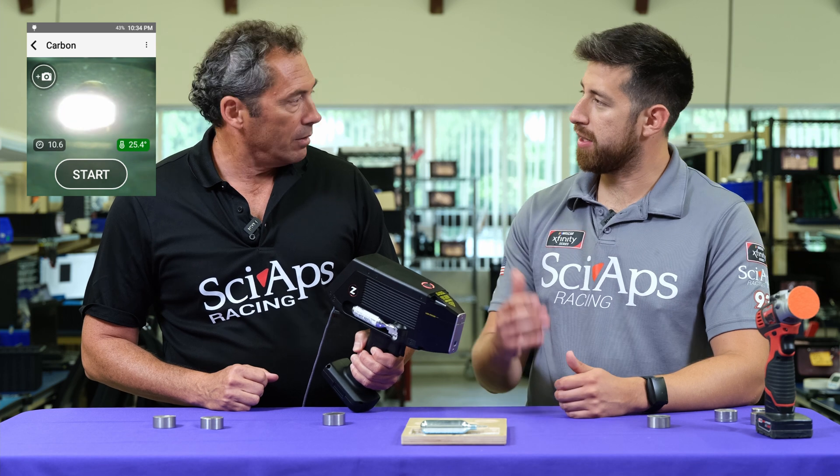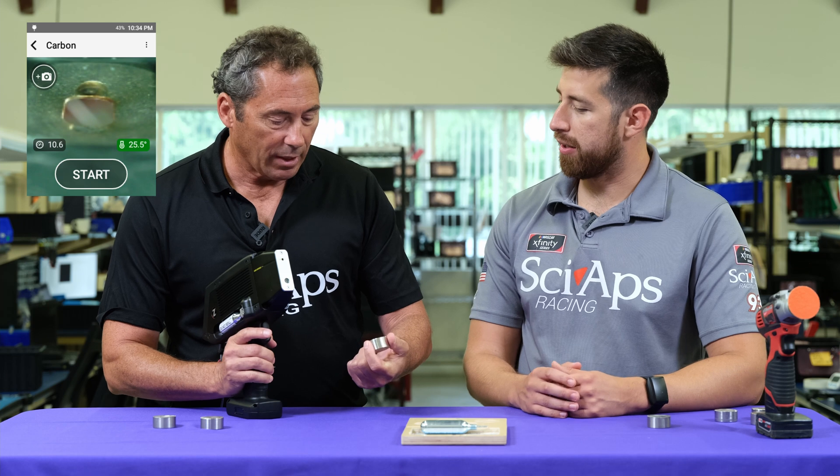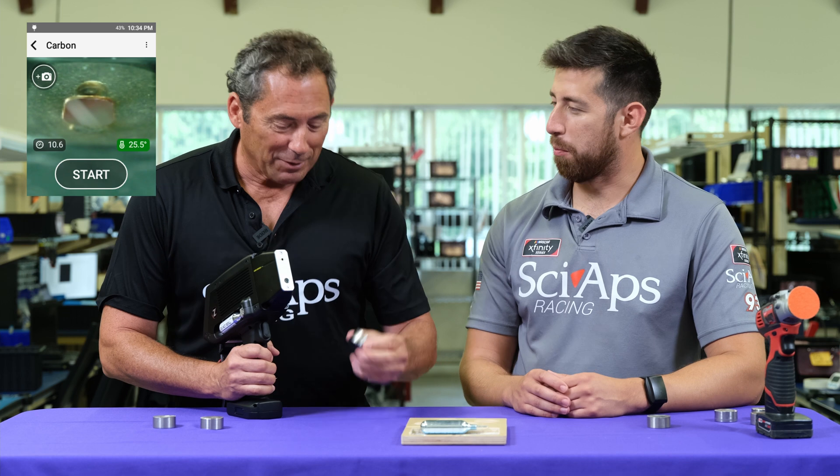Let's test some L-grade, because that's what a lot of our customers ask for — the ability to see carbon in L-grades. We just so happen to have a 316L here. It's like we're prepared today.